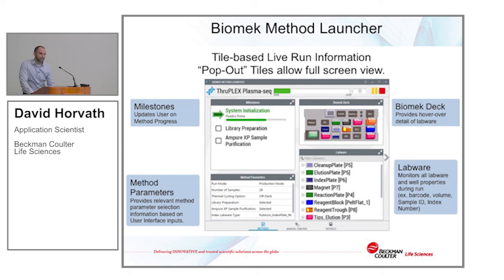You'd be able to expand the plate there and be able to see which indices are in each well and the types of data that you're associating with that sample. Volume is a default data set, but any type of sample ID information or barcode information that you're tracking through your process will be visible at runtime now and will update dynamically at each step in the method.